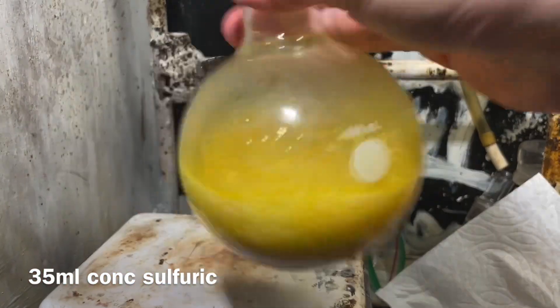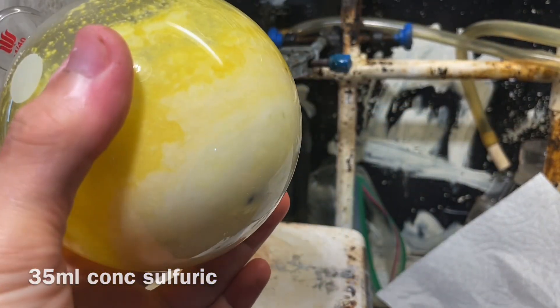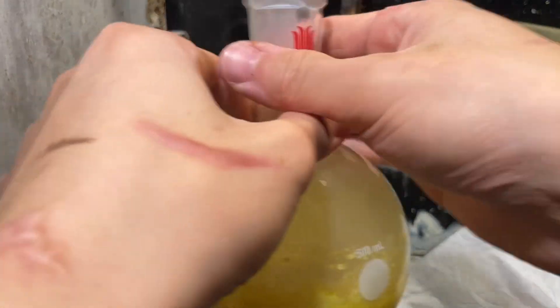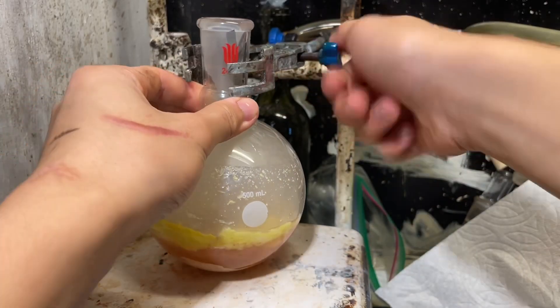I won't recommend a stir bar, because you're going to be cooking this thing for at least 9 to 20 hours at 200°C. The iron(II) sulfate is actually pretty interesting — it acts sort of as an inhibitor; it slows down the reaction. Normal Skraup synthesis is quite exothermic and it might run away making a tar fountain.